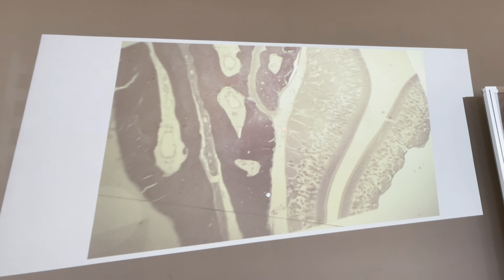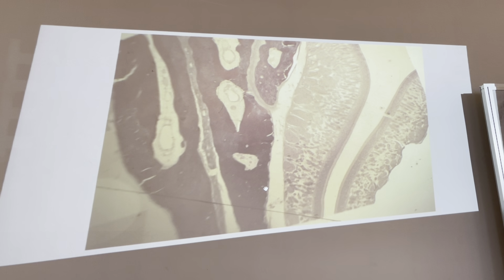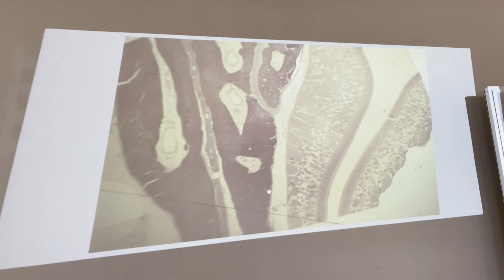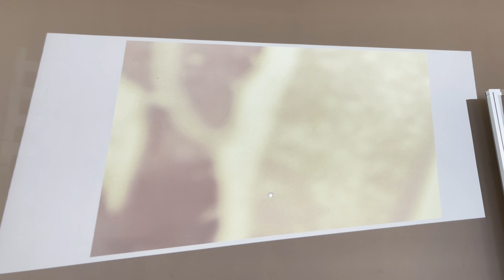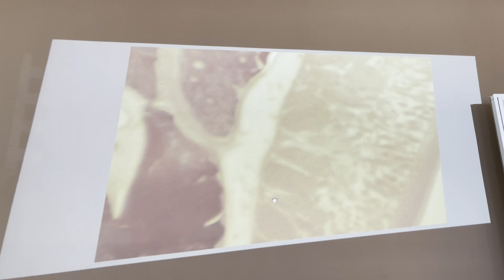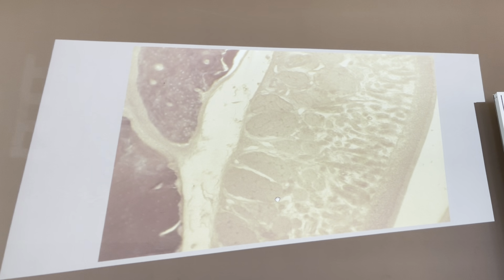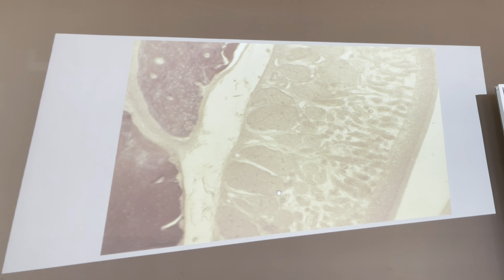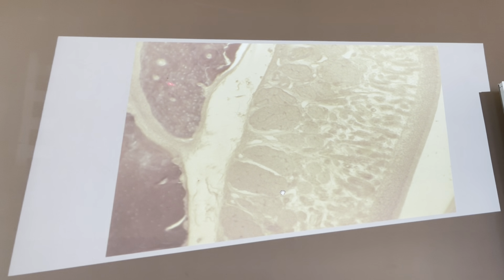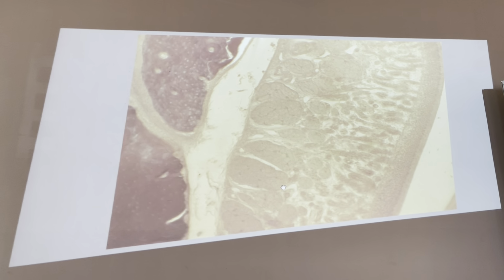From this point to this is the olfactory epithelium. In fact, it consists of three main cells, plus the lamina propria. The superior nasal concha is a compact bone. This is the osteon, and this is the olfactory epithelium, which consists of three main different cells.